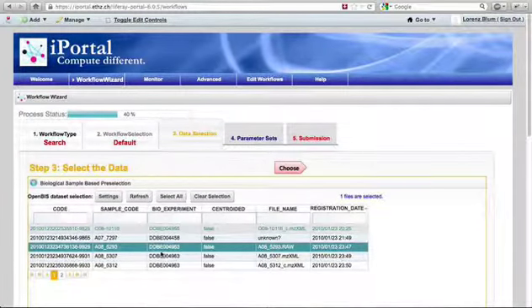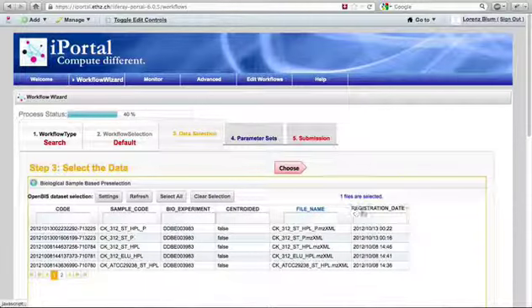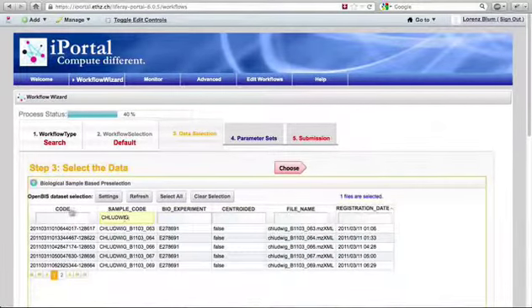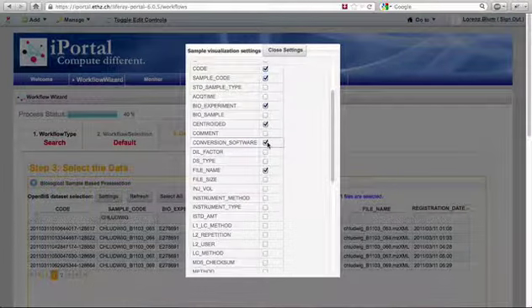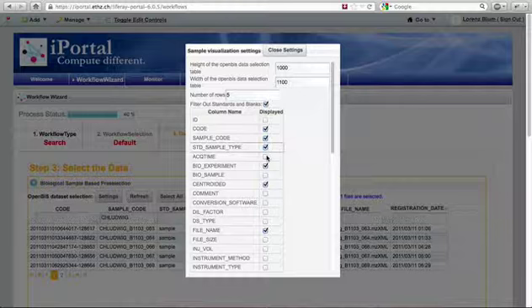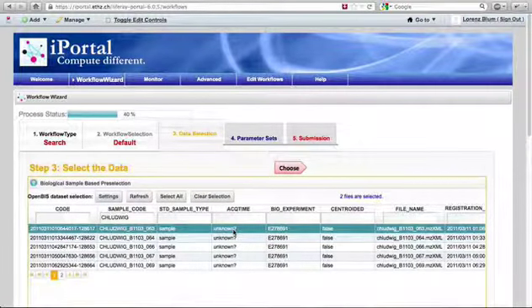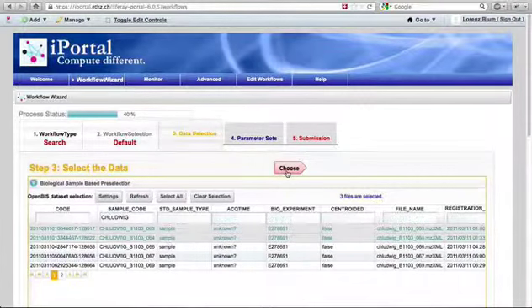These tables are usually very large, so we provide some possibilities to sort these tables and also to filter these tables, for example, by adding some text into the header. For more advanced users, one can even add or remove some more columns showing more metadata coming from the data storage system in order to be able to filter more precisely the files required for the workflow.